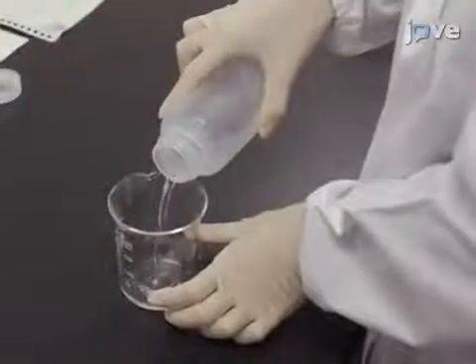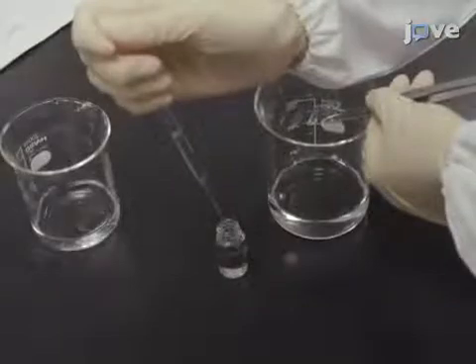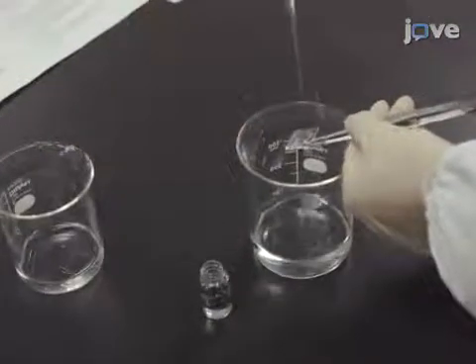Dip the glass substrate in 0.1 molar aqueous hydrochloric acid. After 3 minutes, rinse the substrate with 5 to 10 milliliters of ultrapure water.